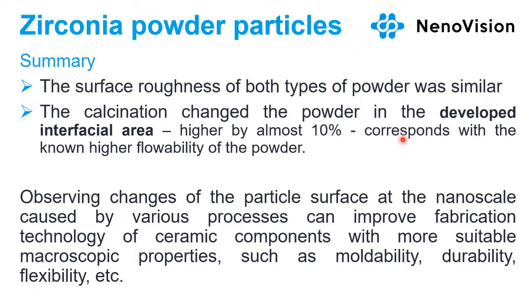So this kind of research, observing the changes in the particle surface at nanoscale, can improve fabrication technology of ceramic components with more suitable macroscopic properties such as moldability, durability, whatever is needed for the specific application.